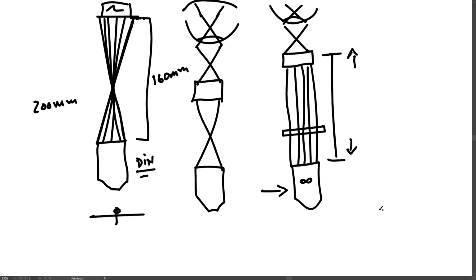Okay, just one more point about objectives and the diffraction barrier. Since any object side by side that's closer than 250 nanometers, or 750 nanometers if the objects are one on top of each other, both of these appear as a single object because they're closer than 250 or 750.